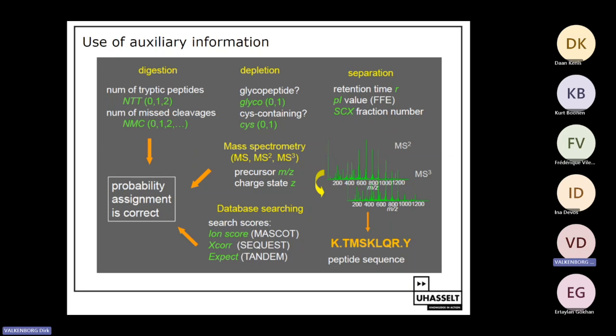Or, for example, if we discover a peptide, we could compute for that peptide the isoelectric point, which is a physical chemical characteristic of a peptide, and it is related to the hydrophobicity of that peptide. So if we then relate that to the retention time, we could try to understand whether this finding of this peptide would indeed elute at a certain time from the column. So there are a lot of additional filtering steps that could be used to further fine-tune our results.